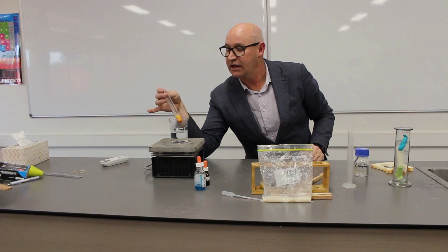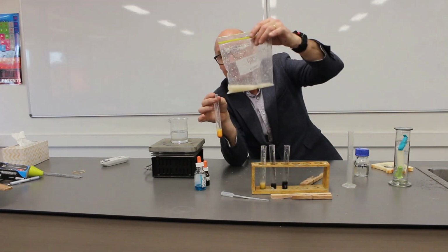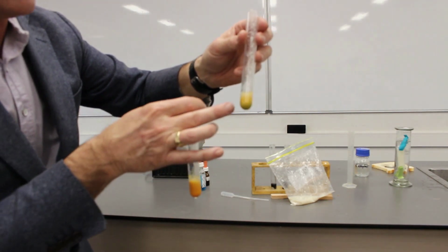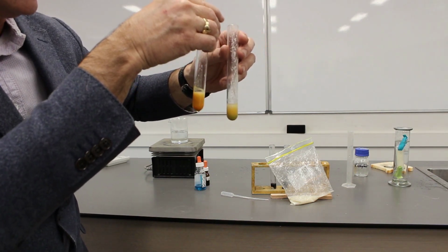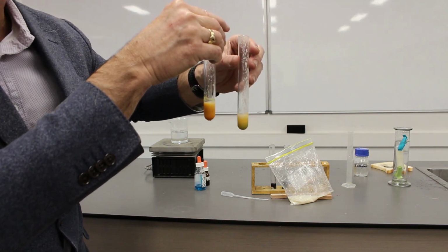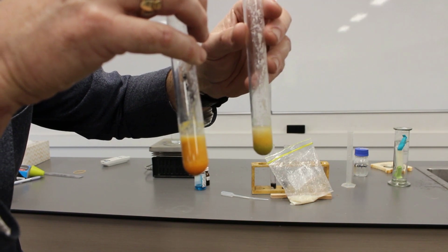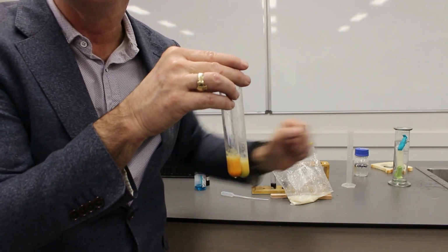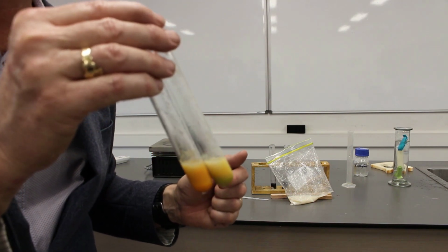Last thing I want to show you is that we've done, this is the results of the Benedict's test after we put the amylase into our bag. So this is what it looked like before we put the amylase in, and this is what it looked like after. Can you see that the one I'm holding here after, how it's got a much stronger red brick colour? A little bit closer if I can. Okay, see this one here is a much stronger precipitate than this one here. Let's see what happens tomorrow after we test the water on the outside of the tube and do the Benedict's test again.